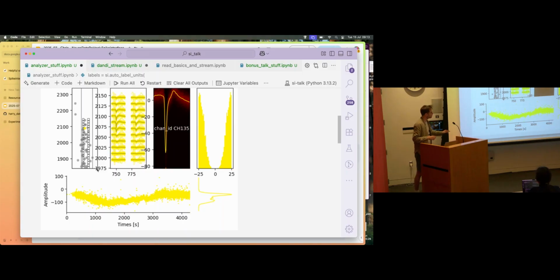Yeah, there could be different reasons for why the amplitude changes with time. The amplitude is the amplitude on the channel that has the maximum amplitude on it. So if your probe is moving a little bit, that can affect the amplitude size, for instance. But there might be other reasons. The fact that the amplitude seems to be varying smoothly suggests that it's a single unit. We try not to take a side about this. We give you the tools to look at this, and you decide what's going on. So have fun.